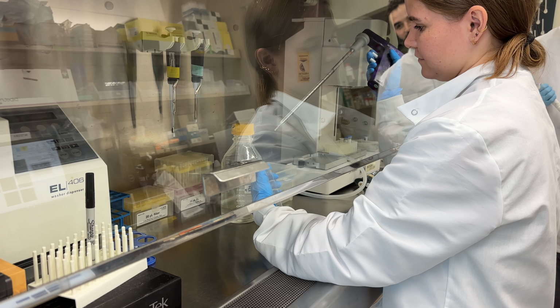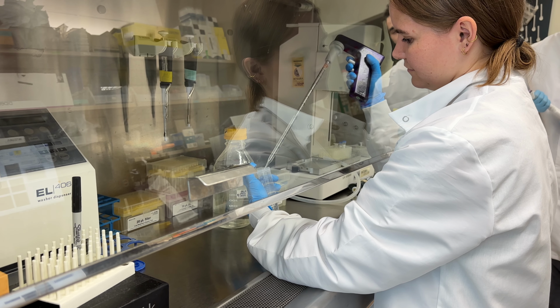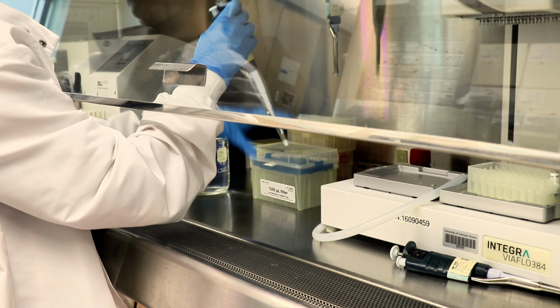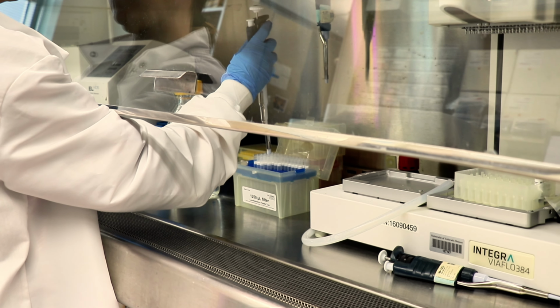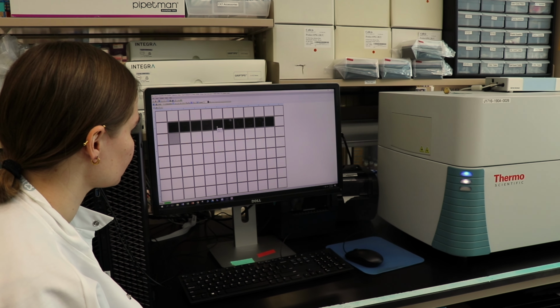In this context, a perturbation is anything that we might want to do to perturb the cells in some way. So this could be a genetic perturbation or a drug perturbation. It just changes the cell in some meaningful way that we can measure with image-based profiling. We do this also in the context of various specific diseases. So we focus on neurofibromatosis type 1, NF1, pediatric cancers, all different types, and cardiac fibrosis.